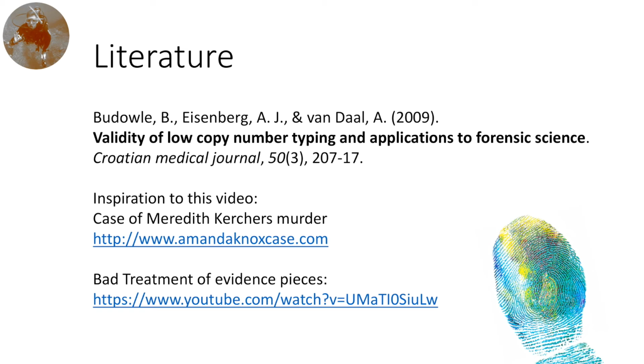And you don't have 5 more cells to do the same thing again. So after all, as a conclusion, LCN can be a really good and important method. It saved many people's lives. But there are problems and you really have to look where you should use LCN.